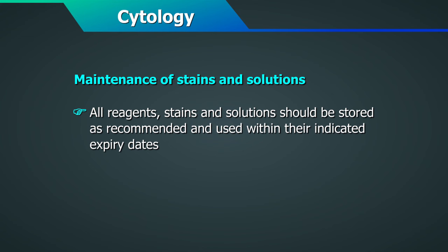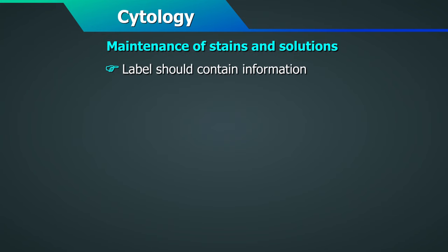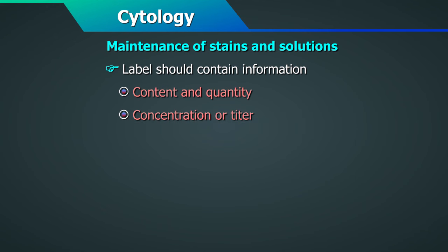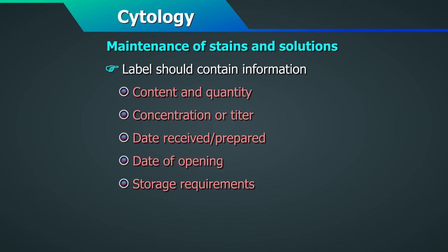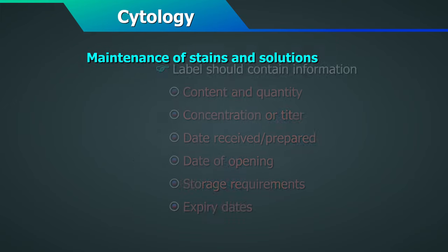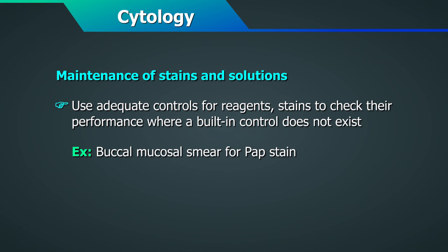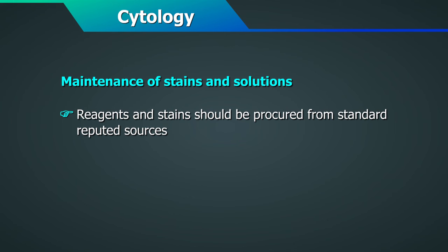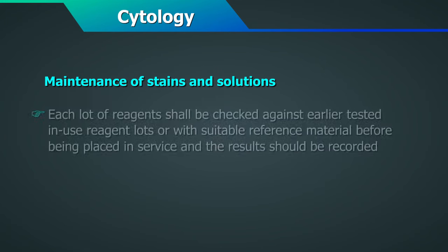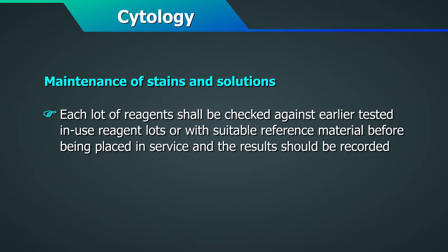Maintenance of stains and solutions: all reagents, stains and solutions should be stored as recommended by the manufacturer and used within their indicated expiry dates. The label should bear the following information: content and quantity, concentration or titer, date received or prepared, date of opening, storage requirements and expiry dates wherever applicable. The laboratory should use adequate controls for reagents and stains to check their performance where a built-in control does not exist, e.g. the buccal mucosal smear for pap stain. Reagents and stains should be procured from standard reputed sources. Each lot of reagents shall be checked against earlier tested in-use reagent lots or with suitable reference material before being placed in service, and results should be recorded.